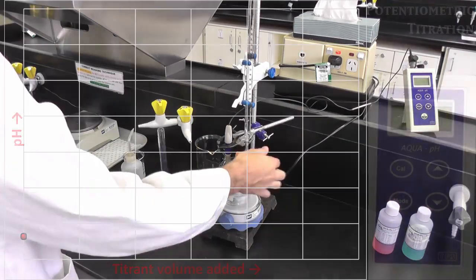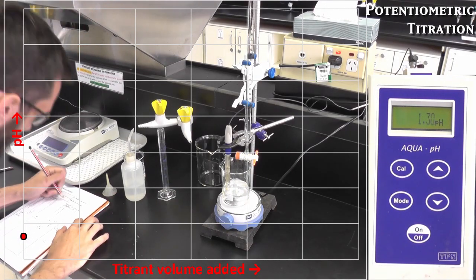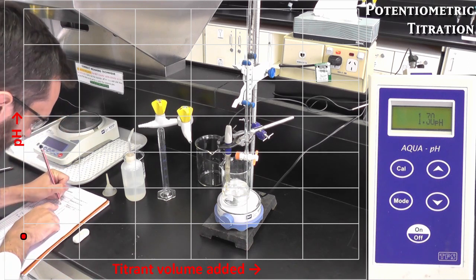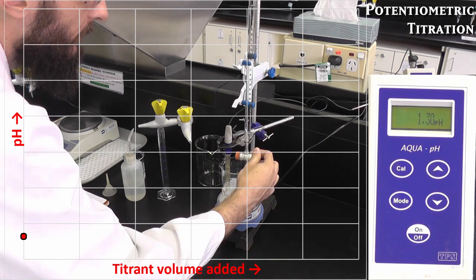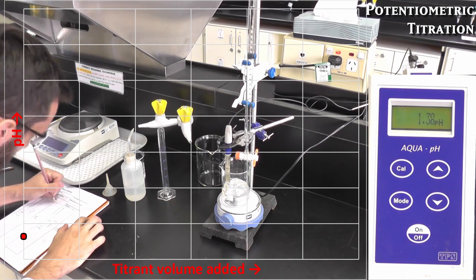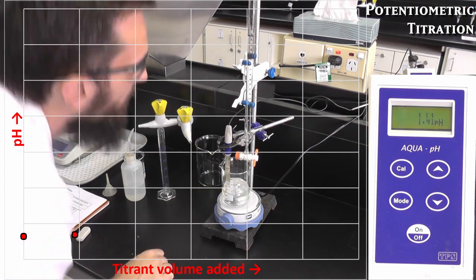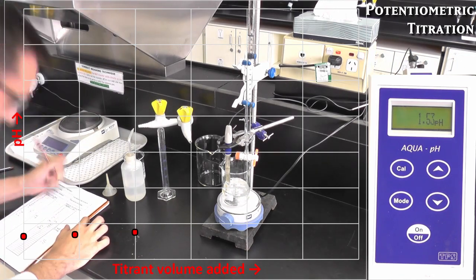Here you can see a demonstration of a potentiometric titration setup for monitoring the reaction between a strong acid and a strong base. On the right, the close-up of the pH meter will allow you to read the pH measurements during the titration. The overlay shows a real-time graph of the titration data, and you may have noticed that there's already a data point on the plot. This represents the starting conditions for the reaction before any of the titrant has been added. In this case, it's on the low end of the pH scale, which means the solution is acidic.